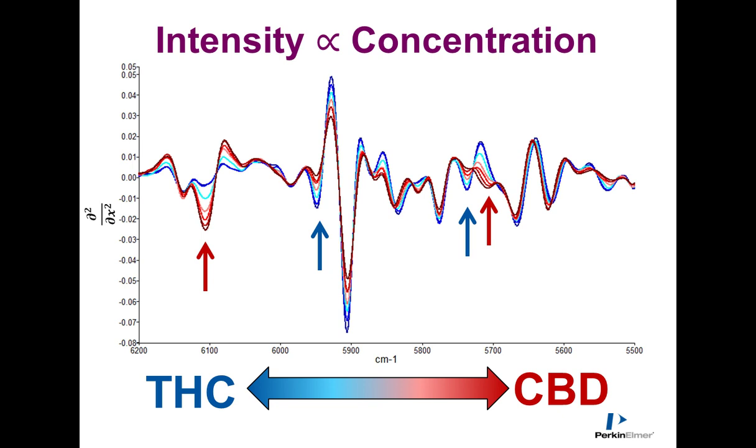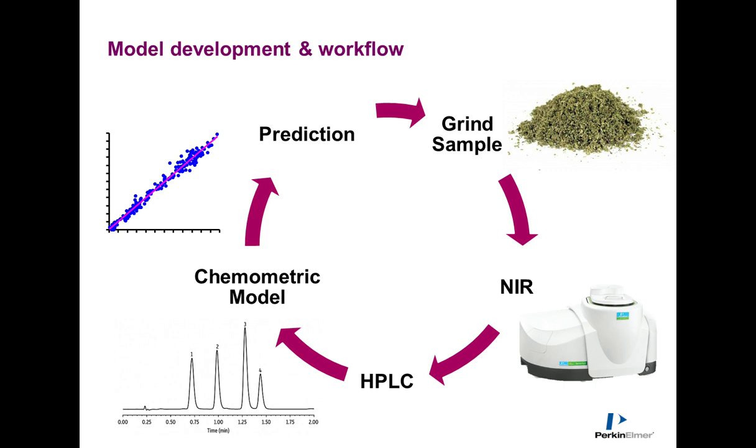This allows us to put together a reference model so it can be used on the laboratory bench or the cultivation bench in a cultivation environment. And what this workflow looks like is here. We see a straightforward grind of the sample. It's placed on the near infrared, and initially a model is made, and that model comes from representative samples with supporting data for the cannabinoid.